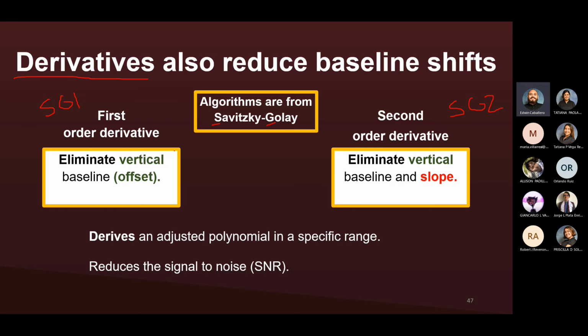Now, what happens when you use derivatives? You have your spectra here. What happens is you take a certain amount of points, which is usually 1 point in the middle, 7 points at each side, for a total of 15 smoothing points. Usually that's the ballpark number of points you use, right? I usually use 15 smoothing points.